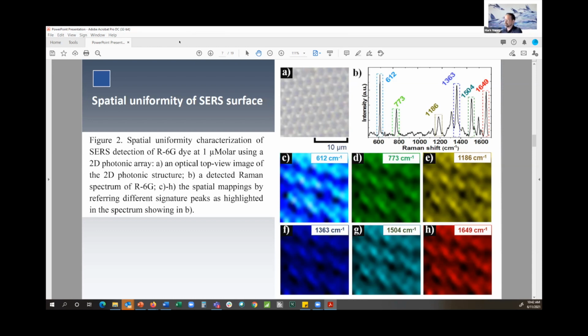They're clumped up in regions. So if you were just to take 5 random measurements, you might come away thinking there are absolutely no cows in this pasture. Or if you hit a clump of cows, you might way overestimate how many cows you have there. So we need to make sure our nanoparticles are evenly spread and our analytes are evenly spread over that surface.